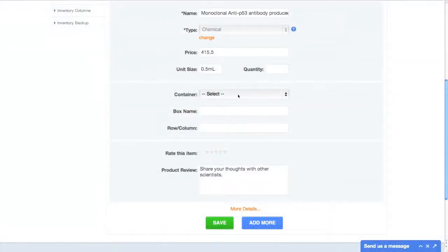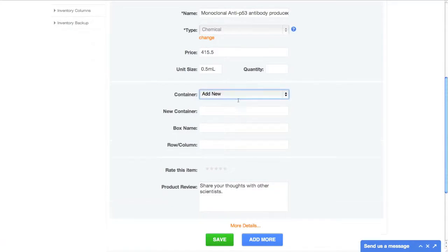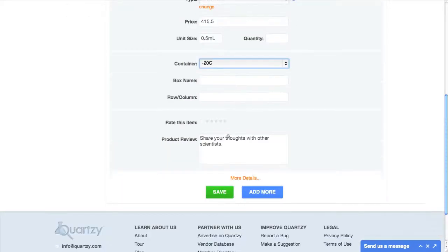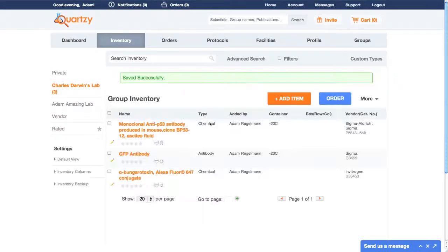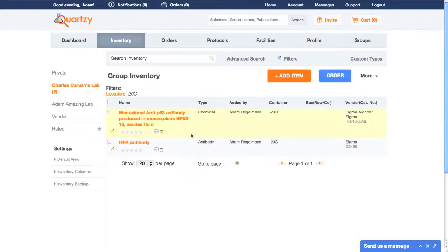While I'm adding a new item to my inventory, I can also add a new container. I'm going to put this item in my minus 20. Once I click save, I can see that the location is displayed. Now, let's say I only want to see items in my minus 20 — I simply filter my inventory by that container, and voila! That's all I see.